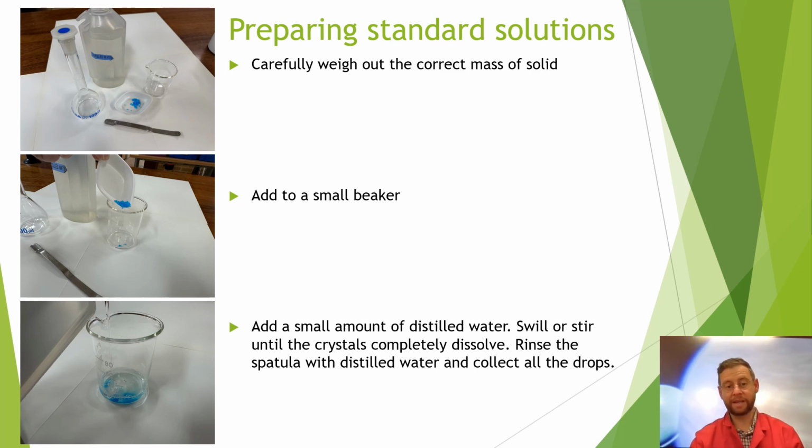We'll add it to a small beaker, and then we'll add a little bit of distilled water, less than the total volume that's required. And then we're going to stir it and stab it and crush it and mix it until it is basically all dissolved. If there are large crystals in there, you're going to have to go at it for quite some time.